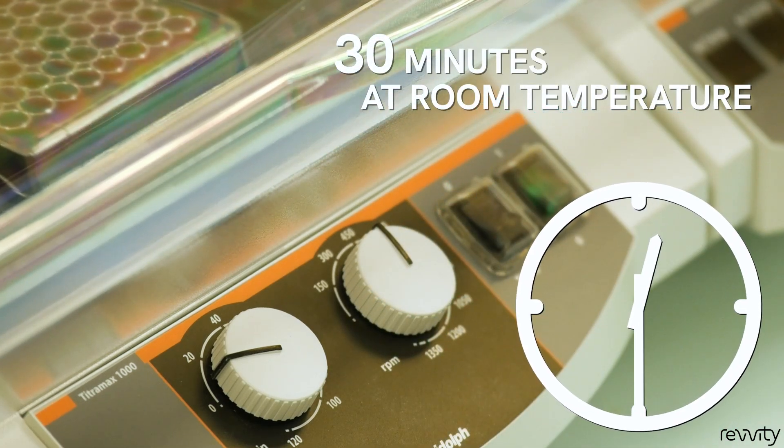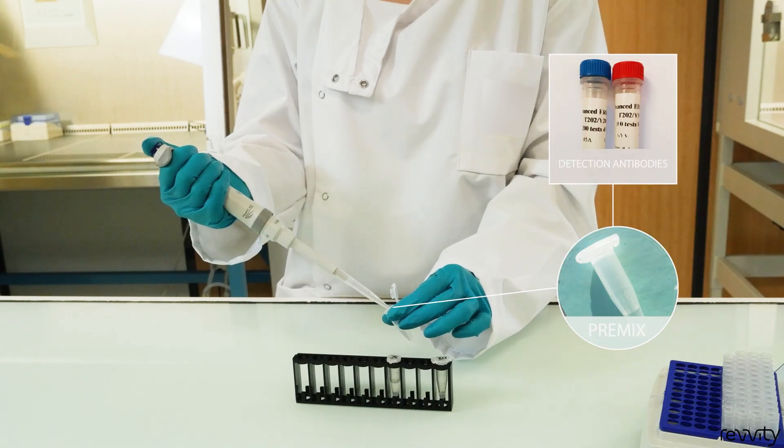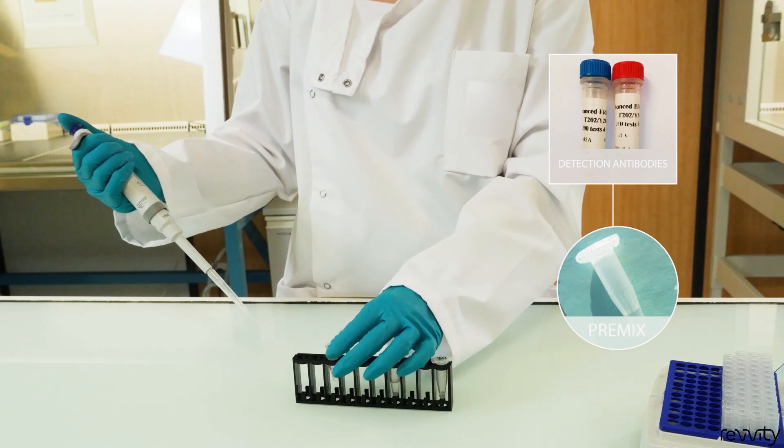During this time, pre-mix the detection antibodies by mixing an equal volume of donor antibody and acceptor antibody.